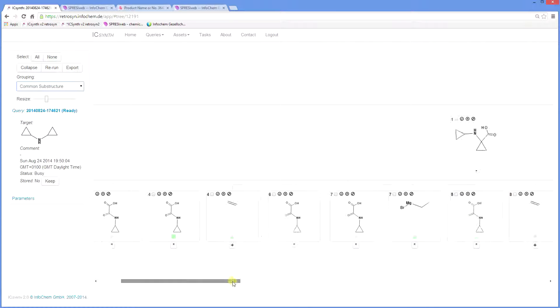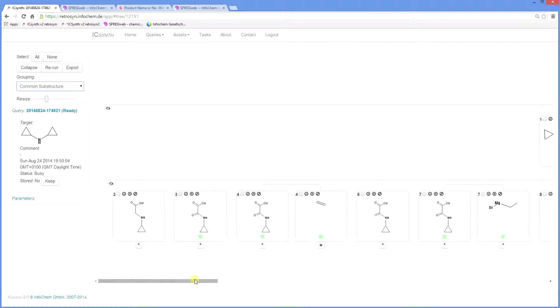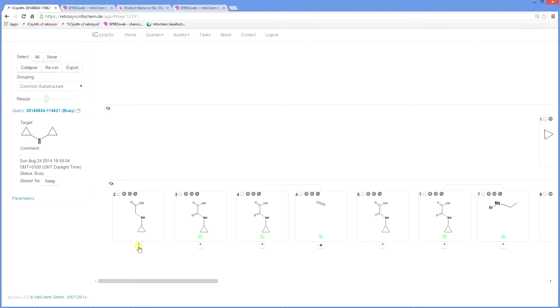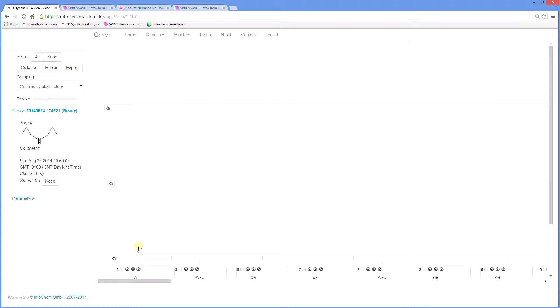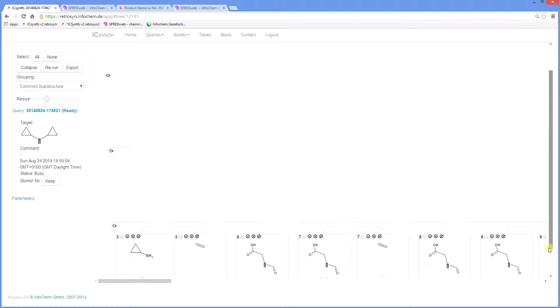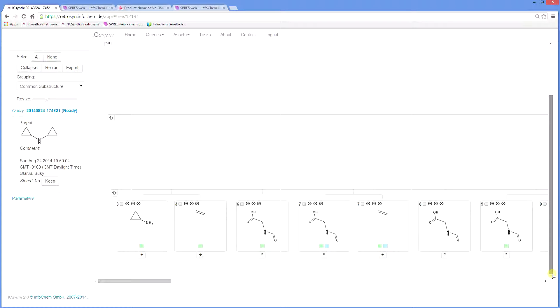You can also select intermediates for further processing by clicking on the asterisk underneath a node. This restarts the retrosynthetic analysis and continues the tree from that node. It will change to a plus sign when complete. We now have the plus sign in place, so the tree has been continued at that point and can expand that node to the next level and browse and evaluate the suggestions.